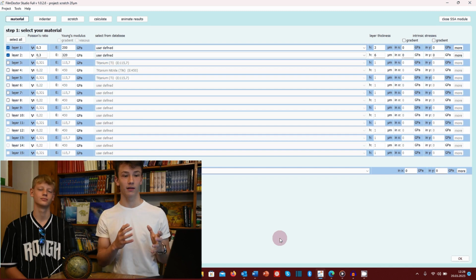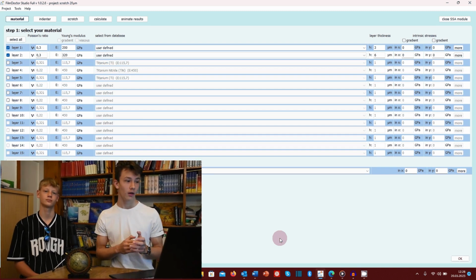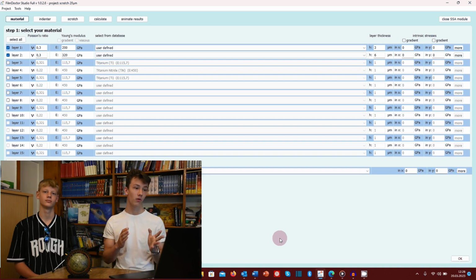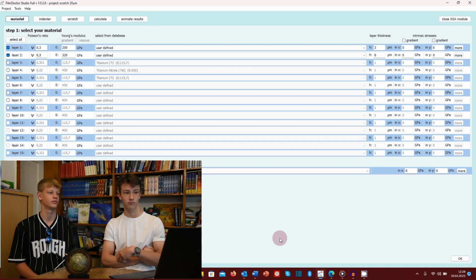There's one thing that you've got to watch out for over here on the material page. So do you have any idea what this could be? Maybe you have to watch out for the true thickness?